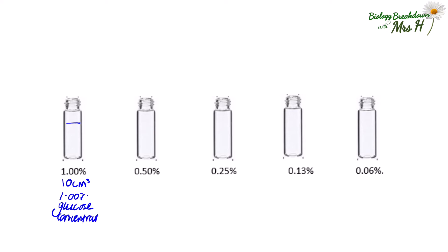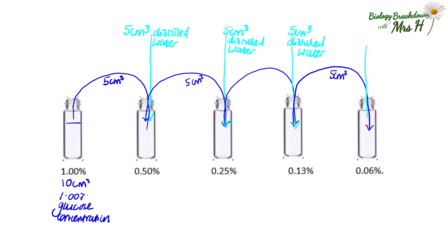To keep the volumes as simple as possible, we will measure out 10 cm³ of the 1% glucose solution into the first glass tube. These glass tubes are ideal for making serial dilutions because we can actually get our syringes right into them. Transfer 5 cm³ of the 1% concentration into the next tube and add 5 cm³ of water. Because we've diluted the 1% by half, we now have 0.5% glucose solution. Then from this tube take 5 cm³ and put into the next tube and add 5 cm³ of distilled water, diluting by half again. So this tube will contain 0.25% glucose solution. Continue with the serial dilution to make 0.13% and 0.06%, and now you have five known concentrations made using a serial dilution technique.